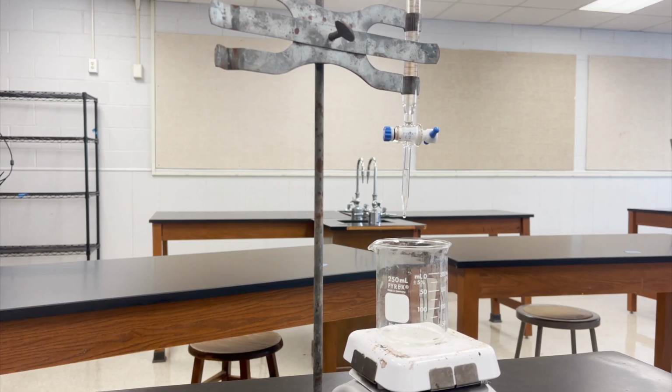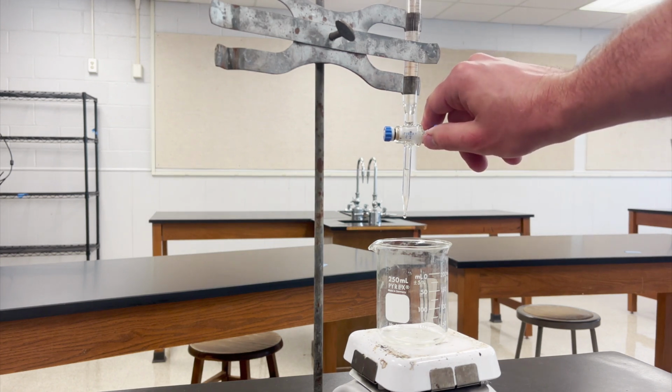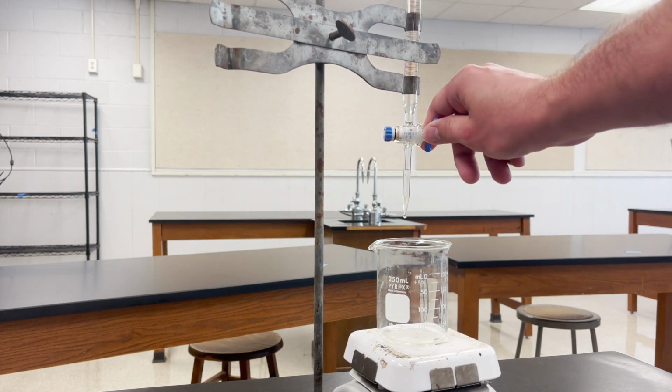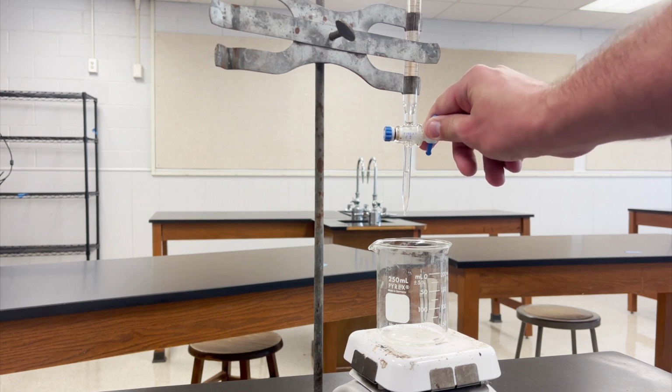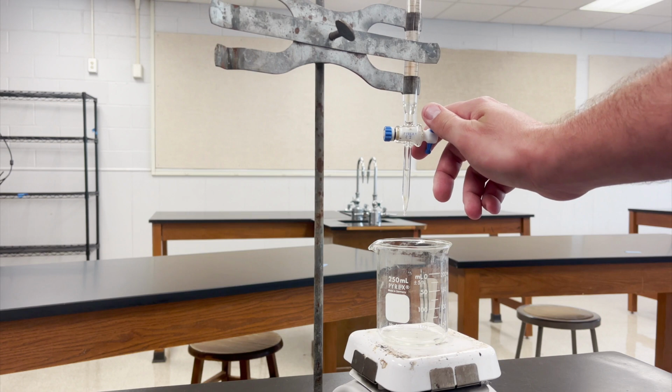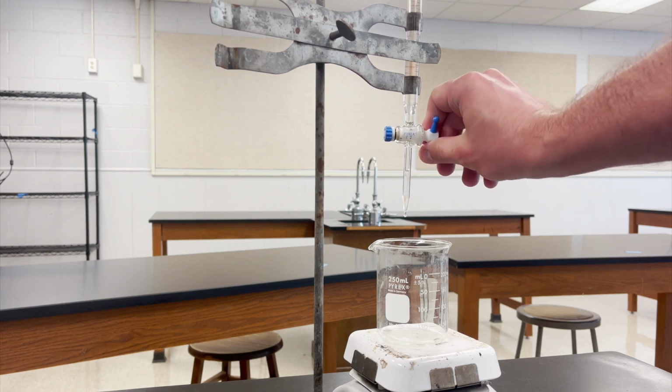Now this here is the bottom of the burette. The burette happens to be a very, very precise piece of glassware. It's one of the more precise pieces of glassware that we have here at Round Rock High School. This allows us to open up the valve to allow some of it to come out. Notice how you can get it to where it comes out in a nice little stream.